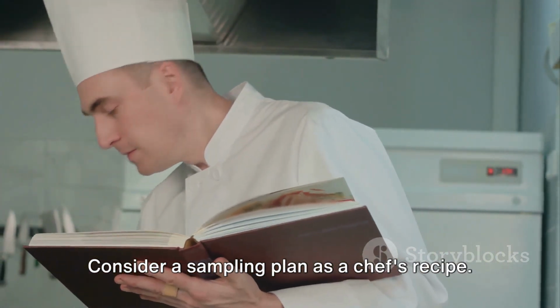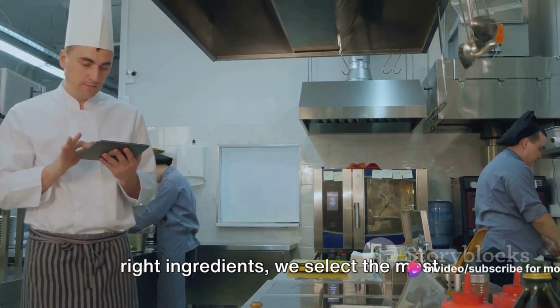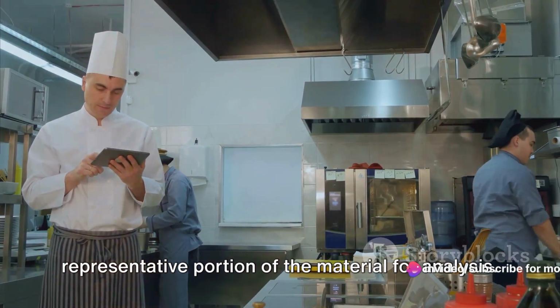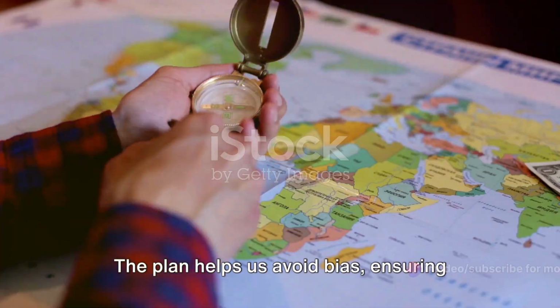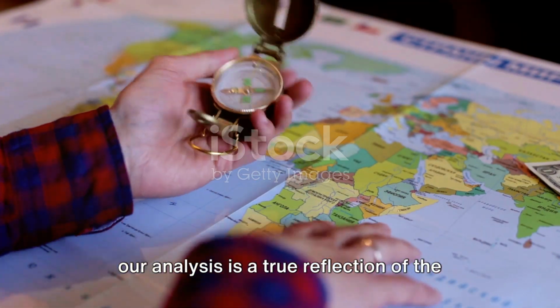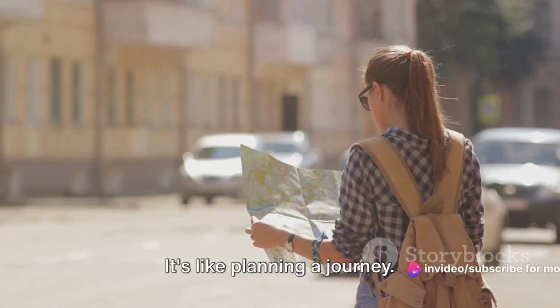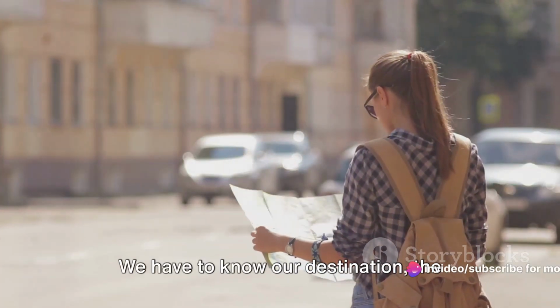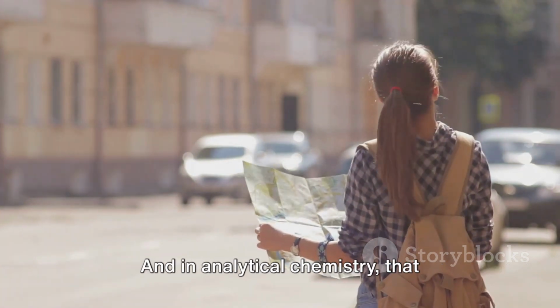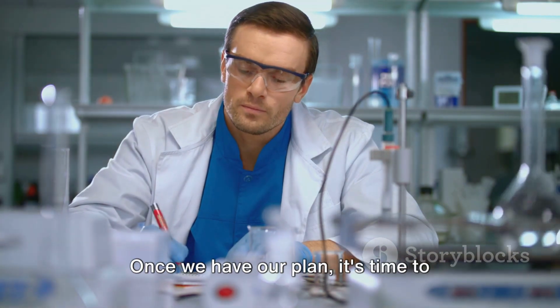Consider a sampling plan as a chef's recipe. Just as a chef carefully chooses the right ingredients, we select the most representative portion of the material for analysis. The plan helps us avoid bias, ensuring our analysis is a true reflection of the entire sample, not just a skewed snapshot. It's like planning a journey. We have to know our destination, the stops along the way, and the best route to take. And in analytical chemistry, that destination is accurate data.